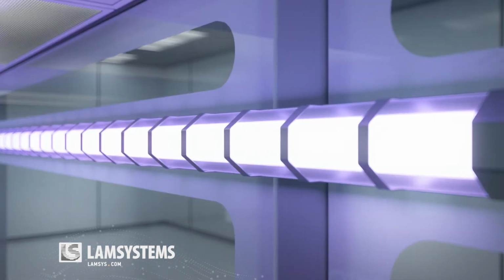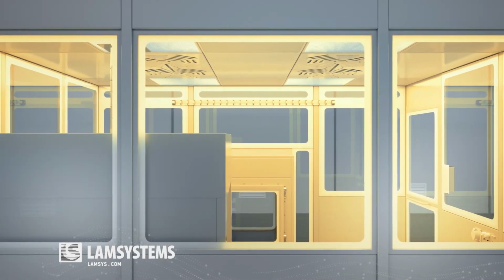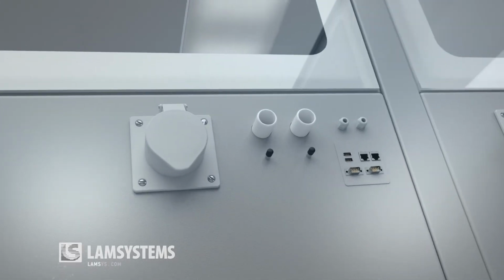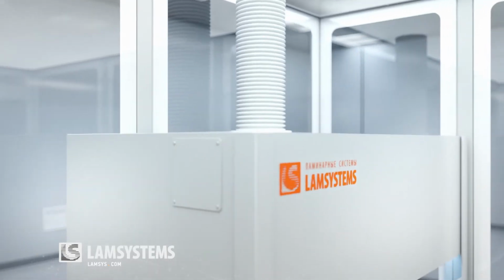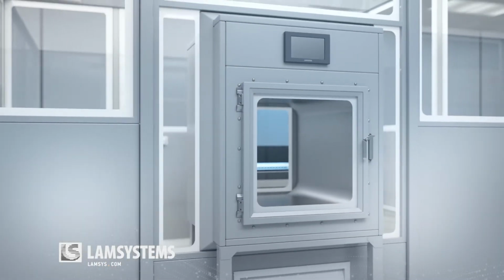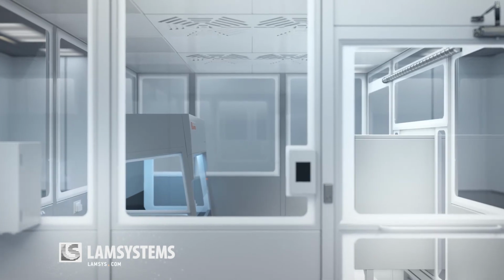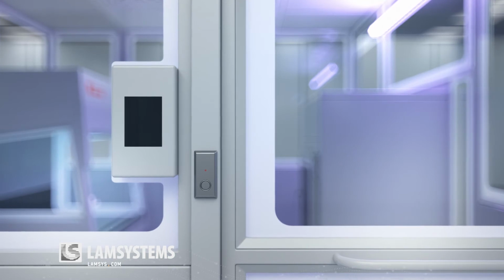Additionally, clean zones can be featured with UV lamps, non-actinic lighting, electric sockets of 220 volts for power device and equipment connection, special voltage sockets, interfaces, pass-through holes, sealed cable ports, exhaust hoods for cabinet installation, fume hoods, pass boxes, and laminar flow cabinets. The control system of a clean zone can have individual activation for separate groups of lights or UV lamps. An individual clean zone access system is also possible.